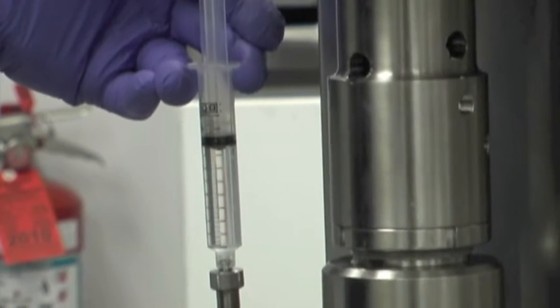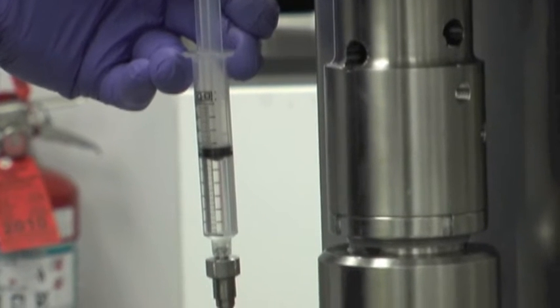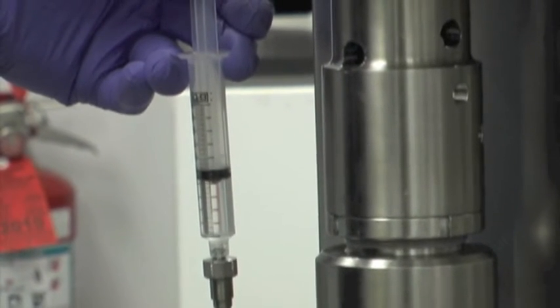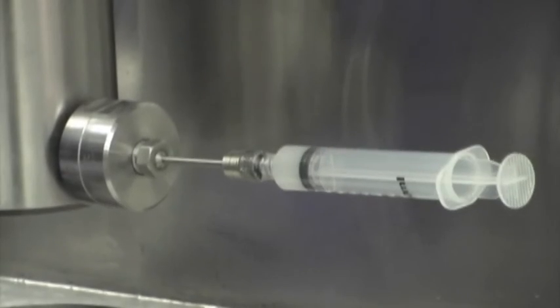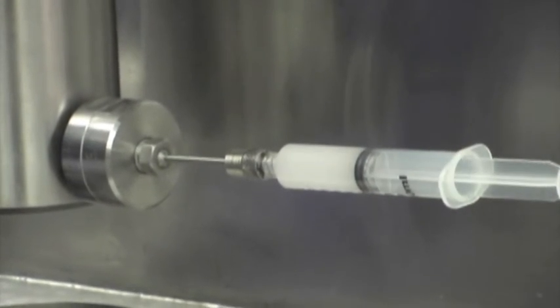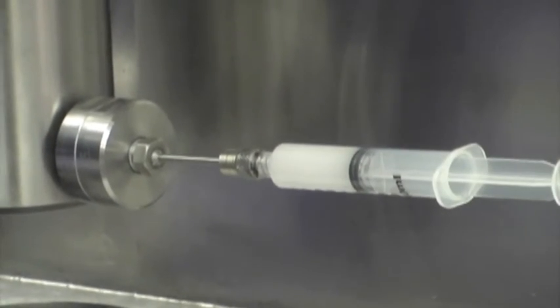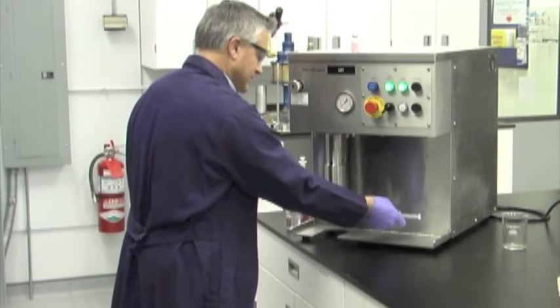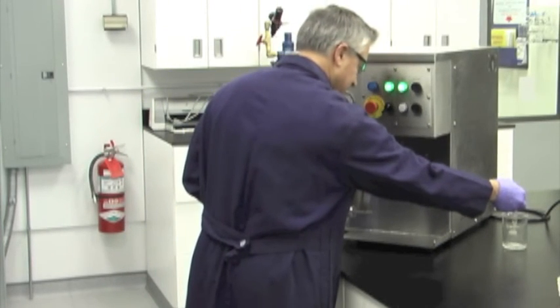Cleaning the machine is just as easy. No disassembly of the equipment is required. Simply run an accepted solution through the processor, exactly as you did your product, and repeat until the collection syringe contains clear solution. Steam in place options are also available for pharma grade applications.